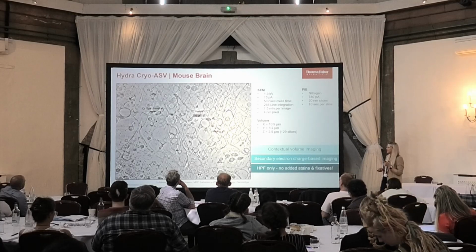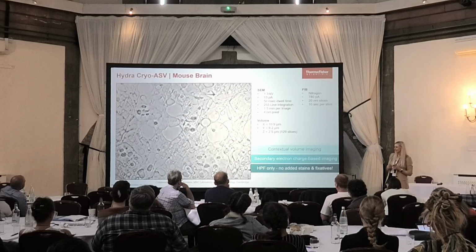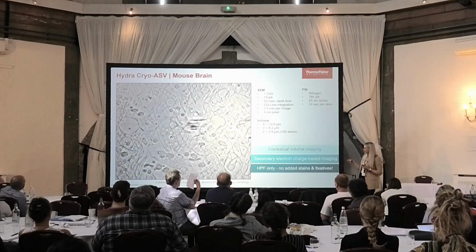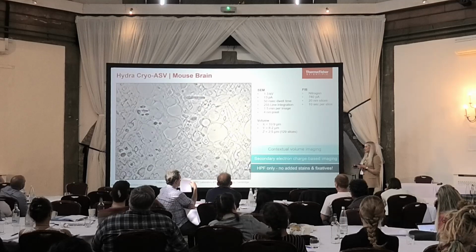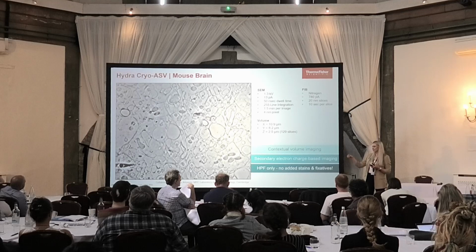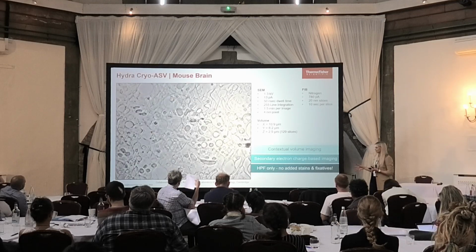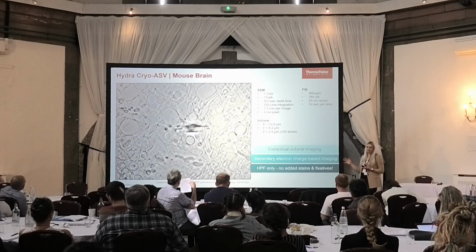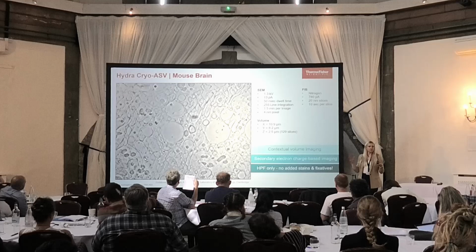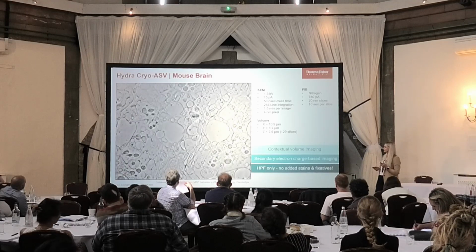It's these videos. This one is of a tissue. That's a mouse brain tissue, and here 129 slices were taken. I think this is also really exciting because you can retrieve tissue samples from native source, and if you can just use high pressure freezing and then use such a technique as slice and view, you can visualize the effects of, for example, drugs or disease states and so on.